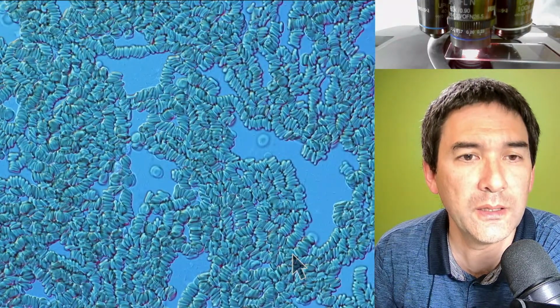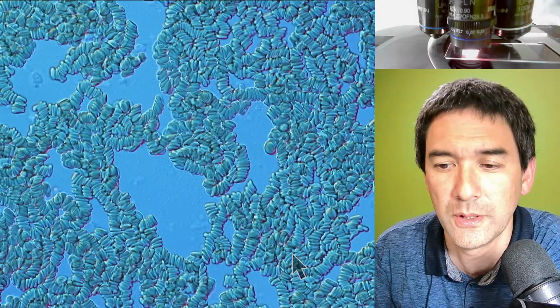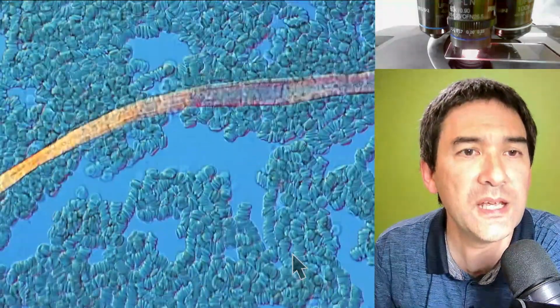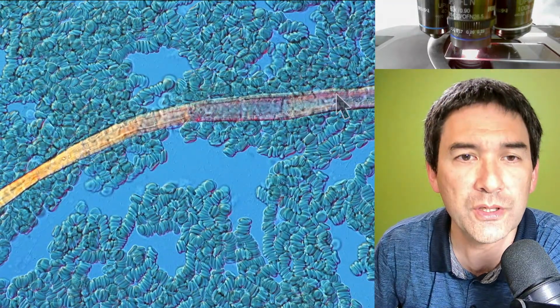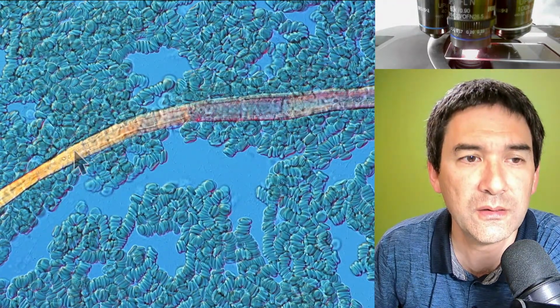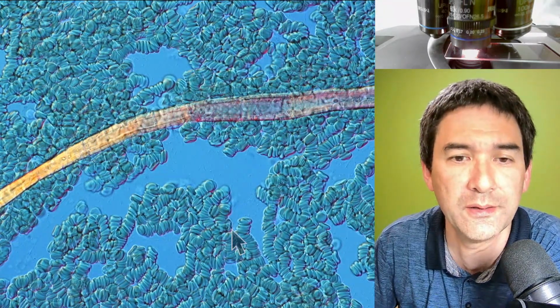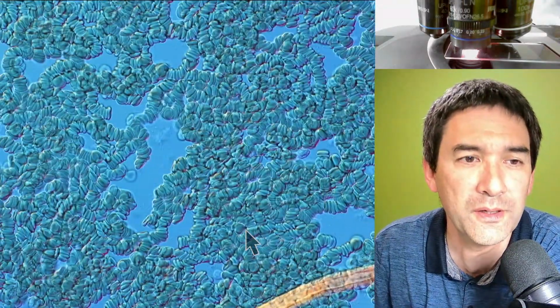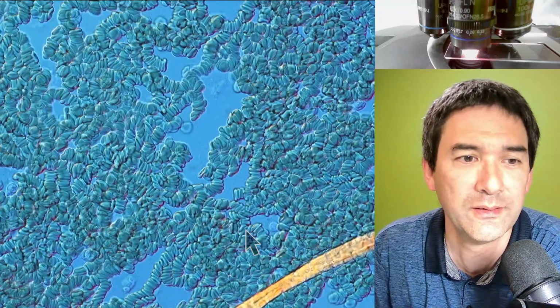So yeah, basically, before I do some staining and some other things, why not show you the video? You see again here this huge thing, yeah. It's a contamination, dust or something that was on my microscope slide. If you see those things in a blood sample, I know from forums people kind of panic. What in the world is that? I said, come on, it's nothing.